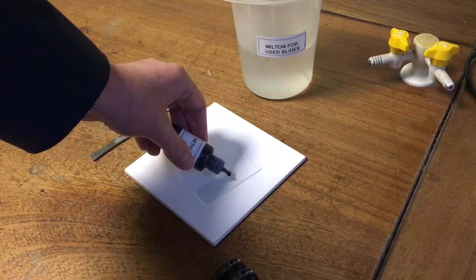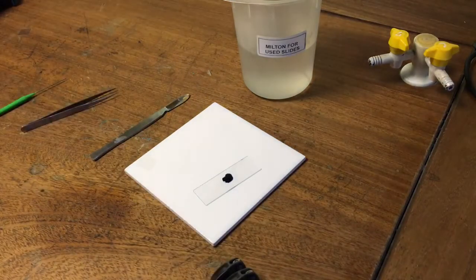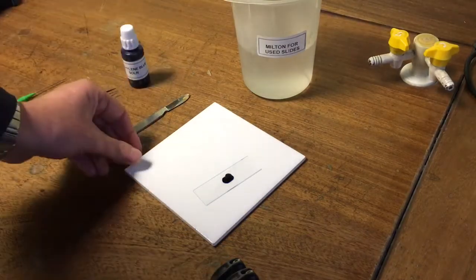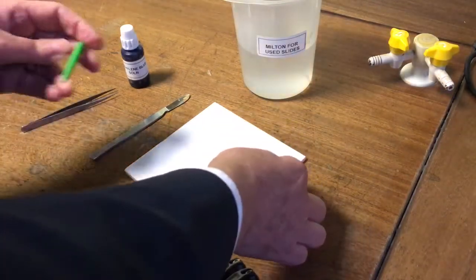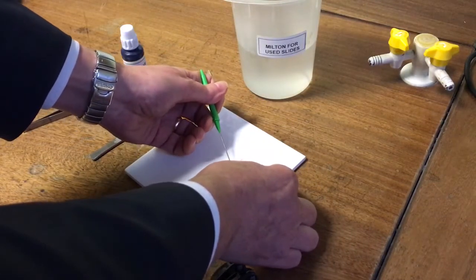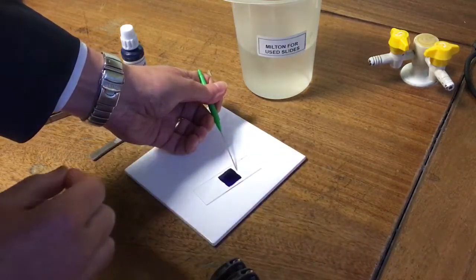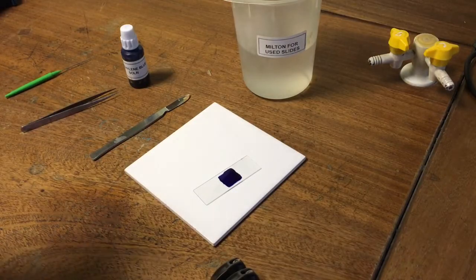I'm going to put one drop of the methylene blue onto the area where I wiped the cells. And then I'm going to gently lower a cover slip over the top of these cells so that it forms a very thin layer. I've only put a single drop of methylene blue, but that's really rather a lot on there.